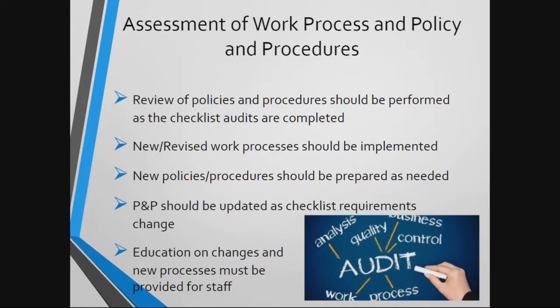As checklist audits are performed, it is also a good time to review all policies, procedures, and forms, making any revisions and creating new as necessary. Additionally, implementing new or revised work processes is easier and more effective because you have the time before inspection to not only create or edit the accompanying policy or procedure, but you also have time to educate your staff, which is a required part of either implementing new processes or changing processes. You must show that that education has taken place.